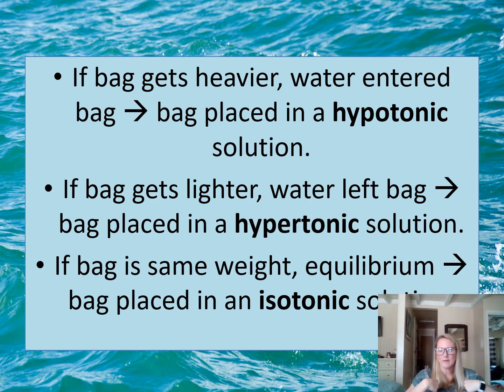And that means that you placed your bag in what's called a hypotonic solution. Now, the way I remember this is hypo kind of looks like hippo, and hippos tend to be larger, right? So if your bag gets larger, heavier, that means water entered the bag and you placed that bag in a hypotonic solution.